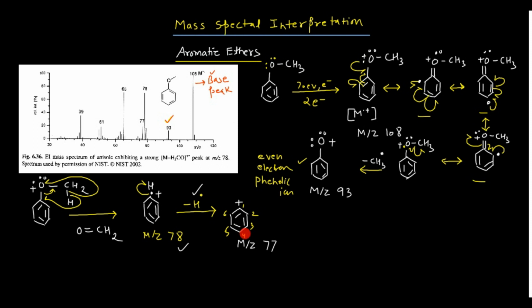So how can I remove this acetylene from here? For this, I need to break certain bonds. When I break this particular bond, one electron comes from it, and again when I break this other bond, one electron comes from here.